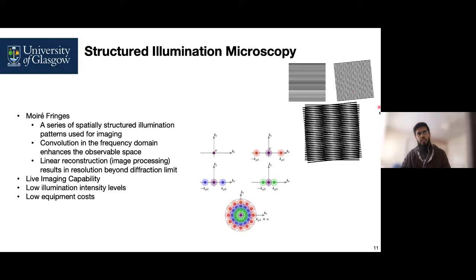This is observed in space, and in the frequency domain this multiplication corresponds to a convolution, which enhances or spreads what we record in terms of the frequency contents of the sample.